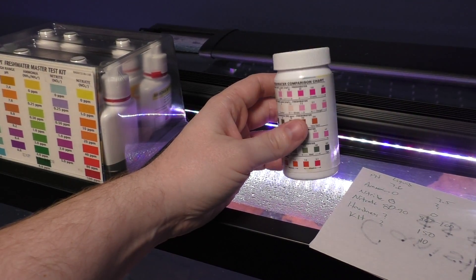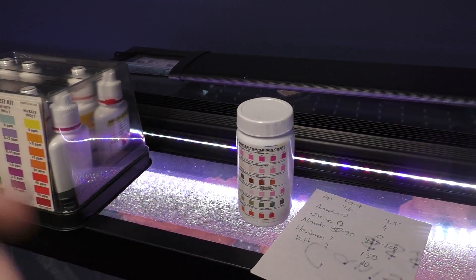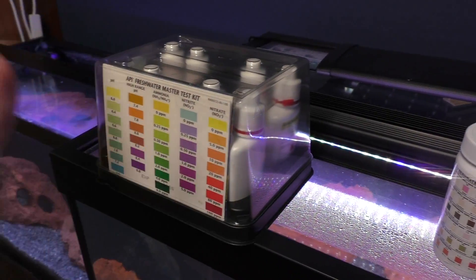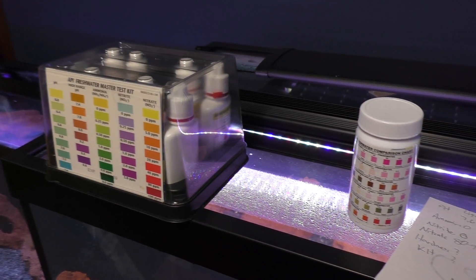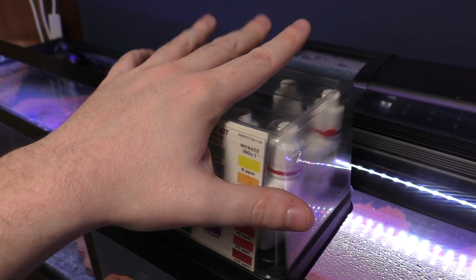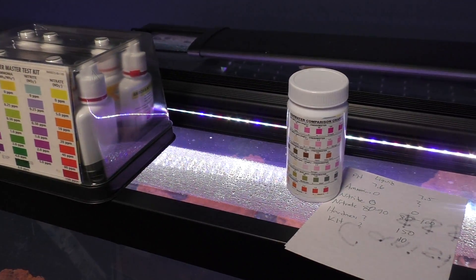Something like this — 25 test strips will run you about $15. The liquid kit runs you about $30, depending on where you're buying. So obviously more bang for your buck with the liquid kit, but the strips are a time saver, and I like the time saver personally.